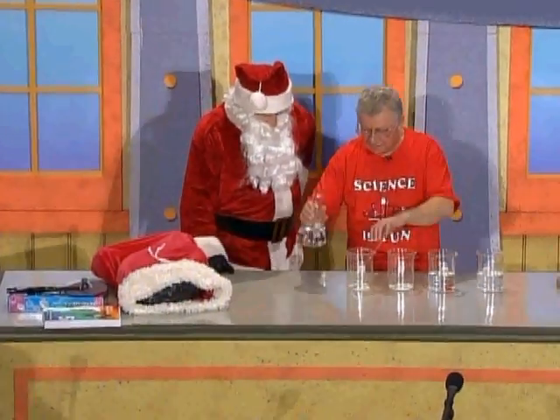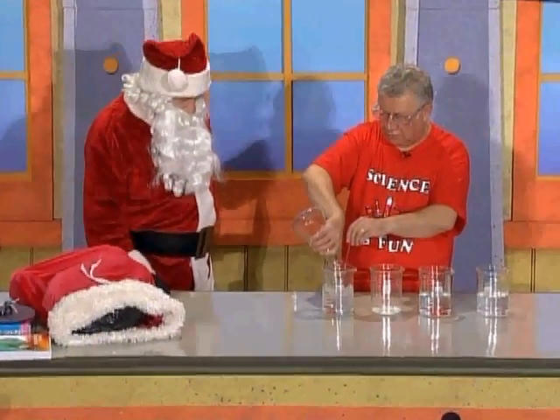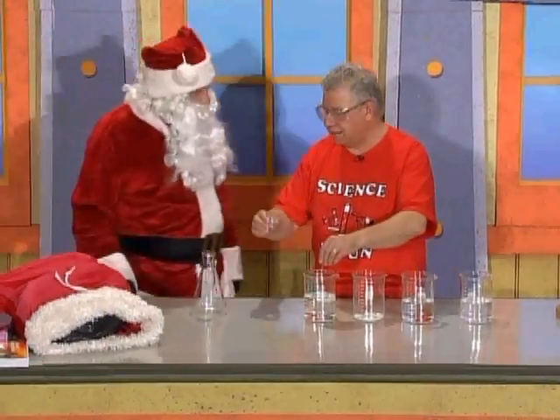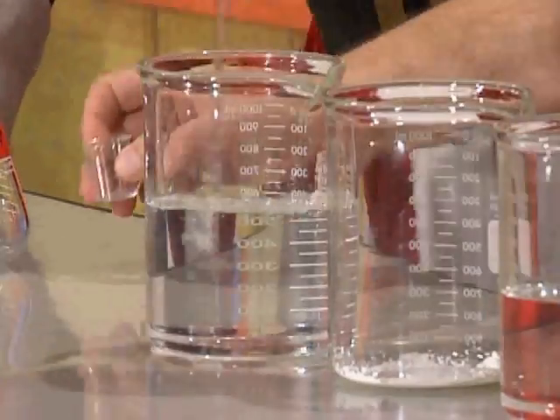I want to take this clear and colorless liquid, put it in there, and make this liquid turn blue. Oh yeah, I like that, that's really good. I'm going to add this other ingredient here and mix that.